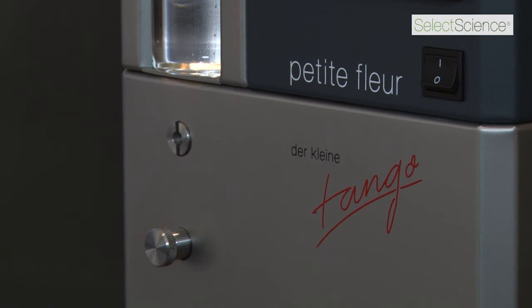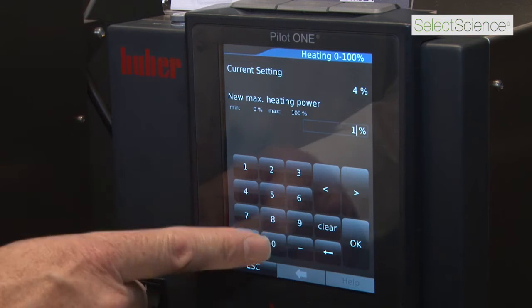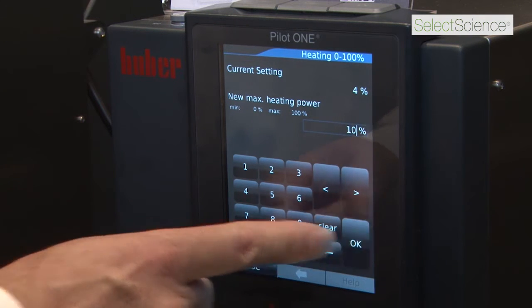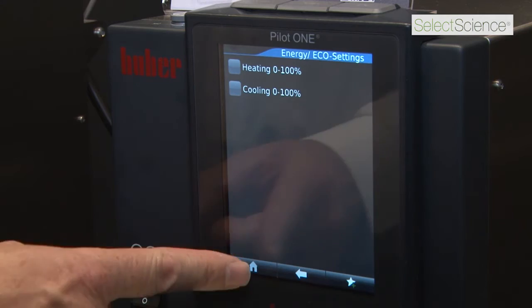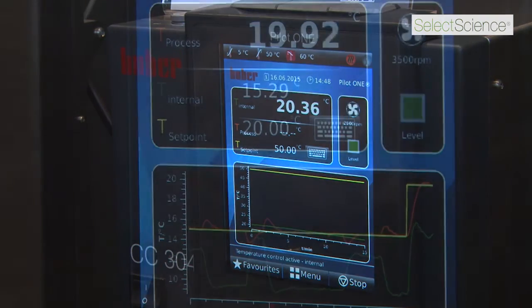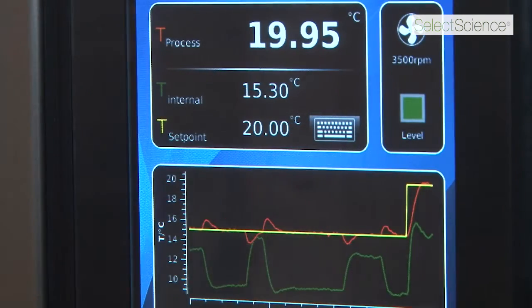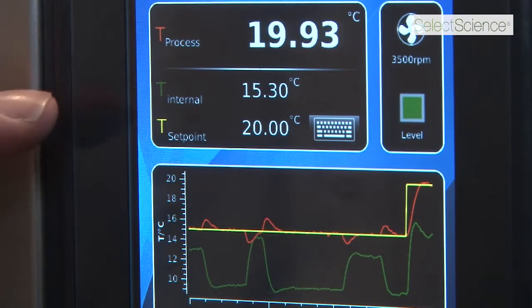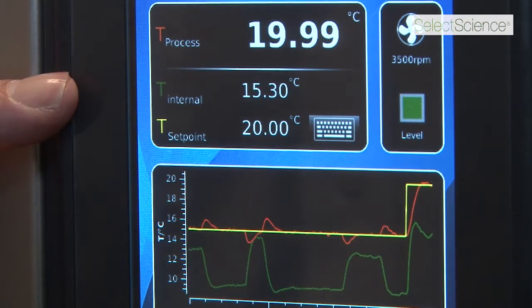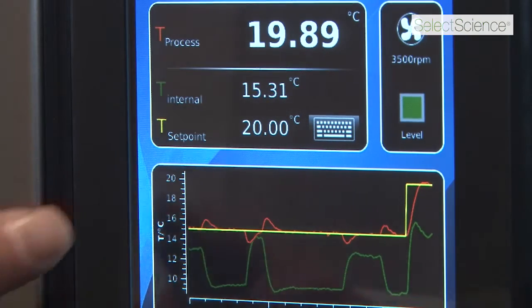We've connected a Petit Fleur to the cooling coil immersed inside the simulated process, and by adjusting the heat in the simulated process we can see the effect on the differences in temperature between the process temperature, the jacket temperature, and the return temperature of the heat transfer fluid coming back to the thermostat.